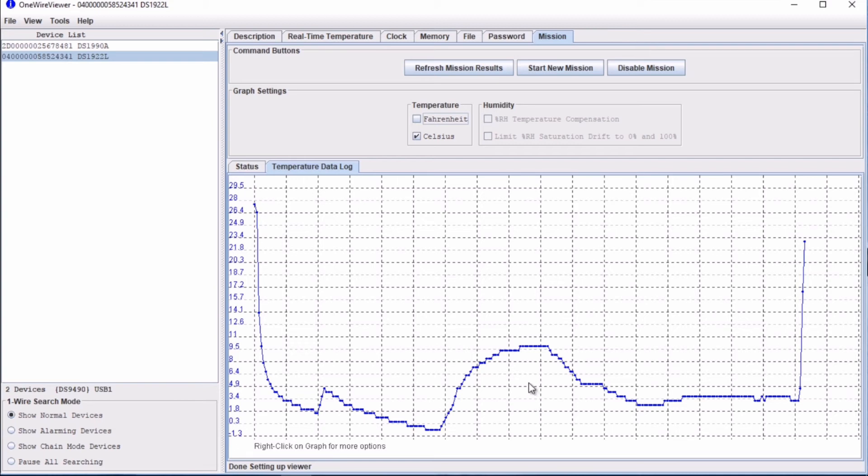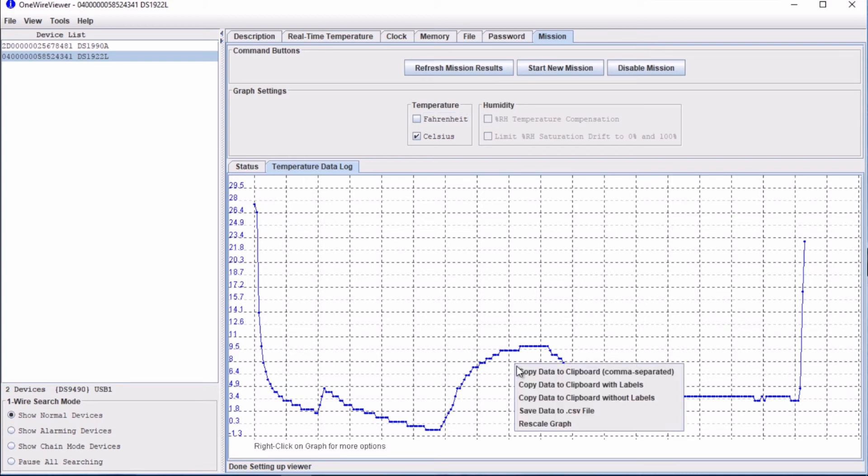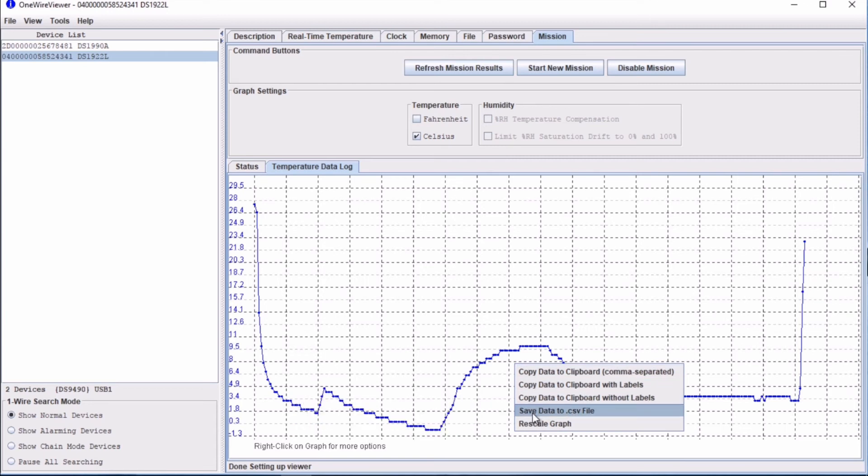To download this data, simply right click and go to save data to .ds csv file. This data can also be viewed in Fahrenheit if needed.